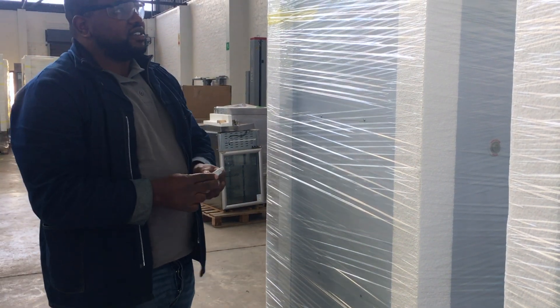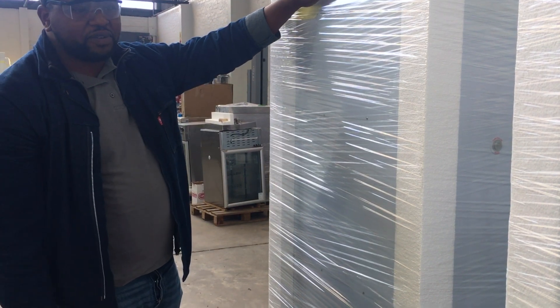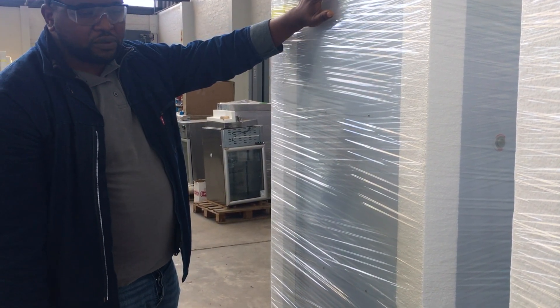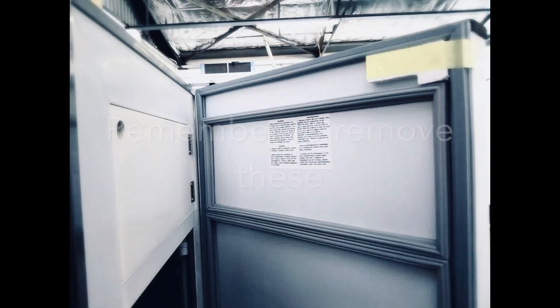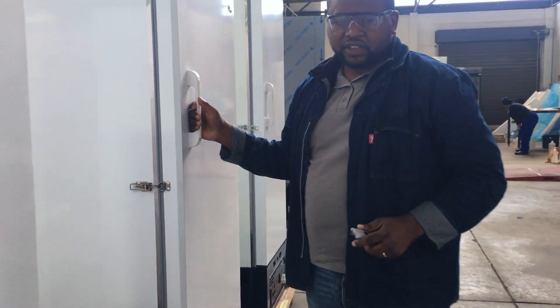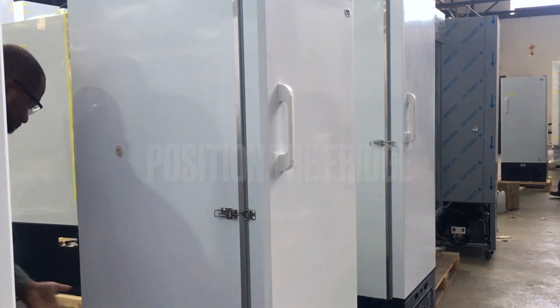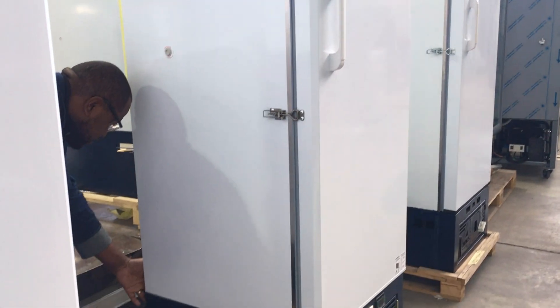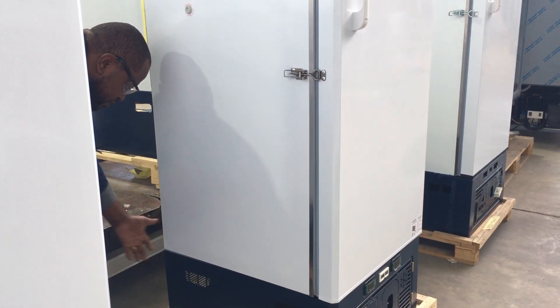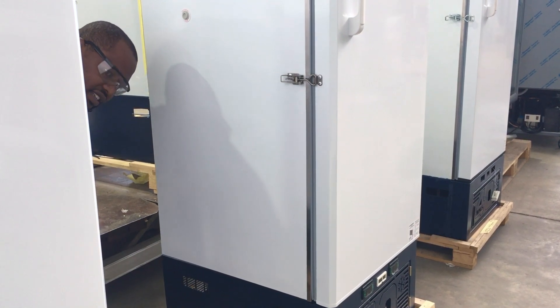Cut the plastic wrap and then remove the styrene. When you remove the styrene, you have to position your fridge. We will be using this one as an example, which is already unwrapped. You have to make sure there's enough gap between the back of the fridge and the wall — at least 20 to 30 cm — and also 30 cm clearance to the ceiling.